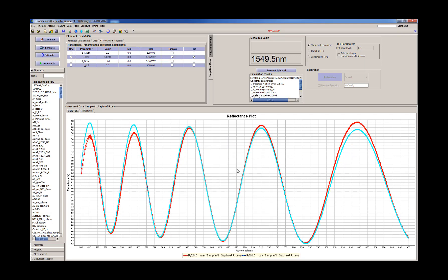So it looks better. We still have a little bit shift at shorter wavelength. It's going up there with the model data, and here it's going down.